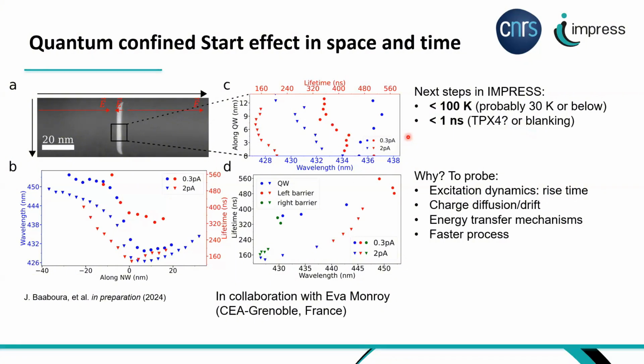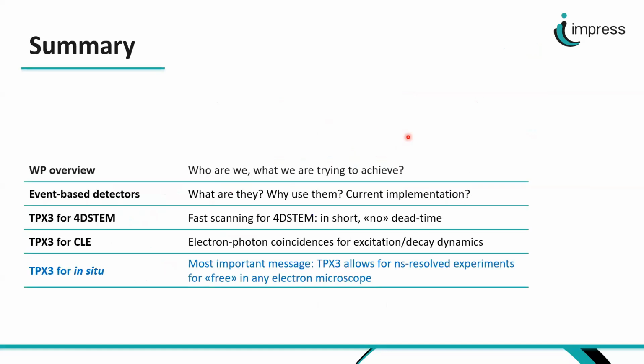And for that, we need a temporal resolution of the order of a few picoseconds to actually see it. And also study charge transfer, energy transfer mechanisms, and also, of course, study faster processes. So with that, I come almost to the end. I just have one slide.